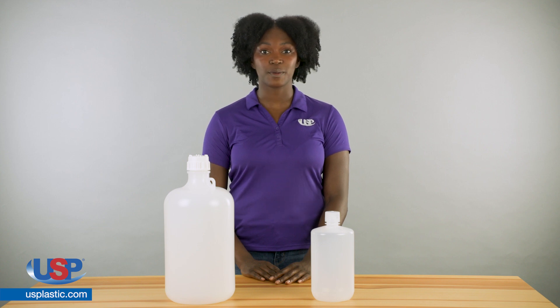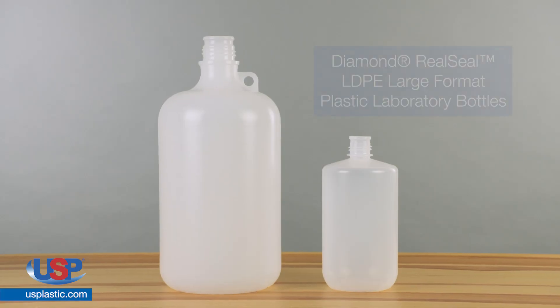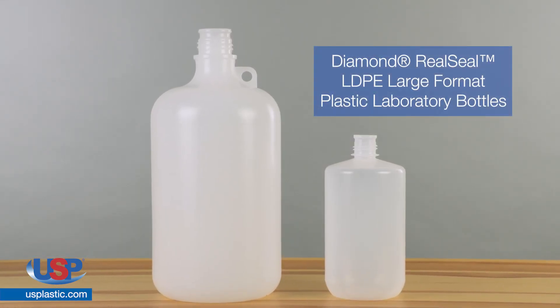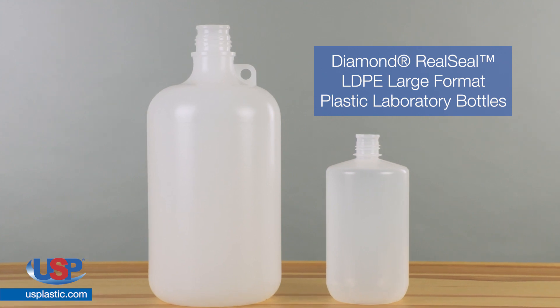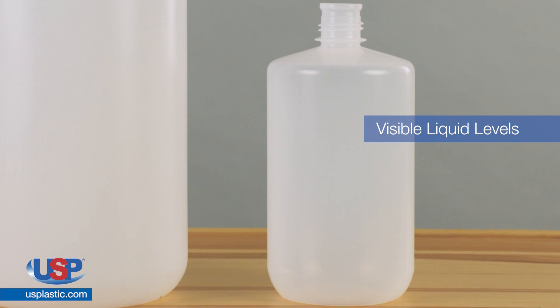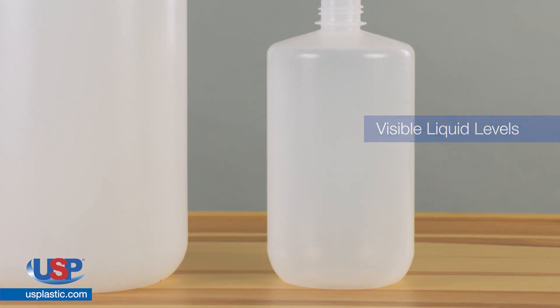From small sample bottles to large format bottles, you always get high quality products at an economical price when using Diamond RealSeal laboratory bottles. Diamond RealSeal LDPE large format plastic laboratory bottles meet the requirements of the most demanding applications. LDPE construction makes liquid levels easier to see than other materials.